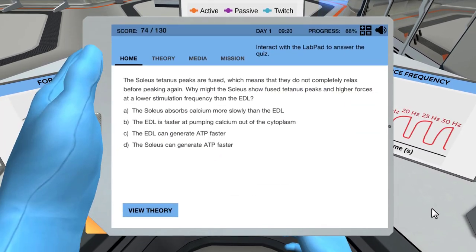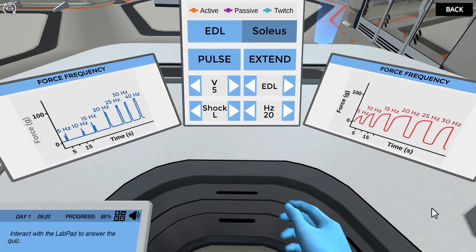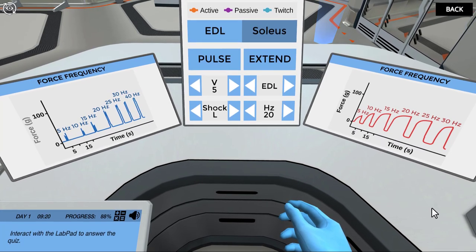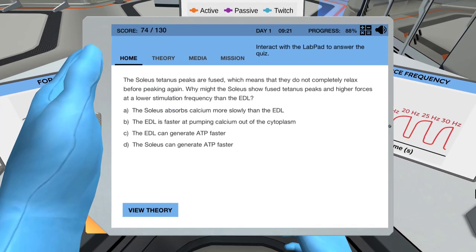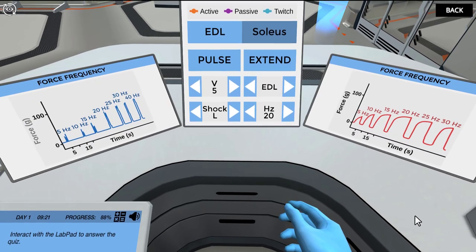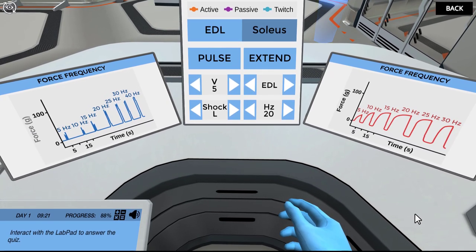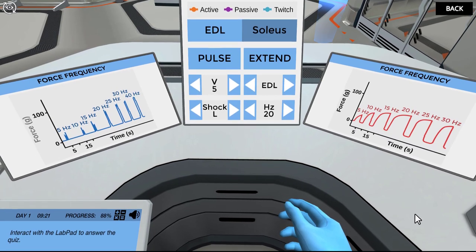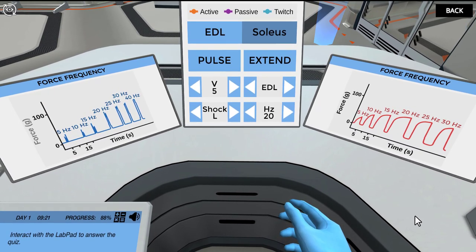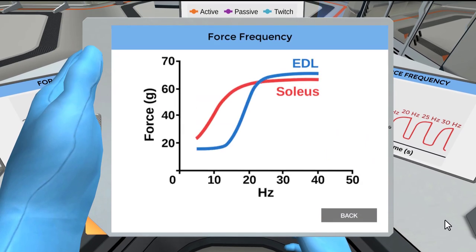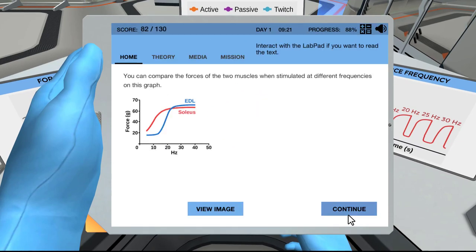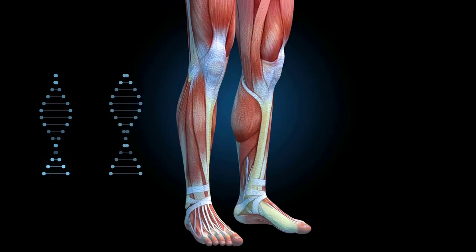The soleus tetanus peaks are fused, which means that they do not completely relax before peaking again. Why might the soleus show fused tetanus peaks and higher forces at a lower stimulation frequency than the EDL? Great work. Yes, the fused tetanus peaks are caused by calcium ions remaining inside the fibers of the soleus. The EDL is faster at getting rid of the calcium ions which then prevents tetanus at the same low stimulation frequencies. You can compare the forces of the two muscles when stimulated at different frequencies on this graph. Awesome job! That was a lot to learn about muscle stimulation.